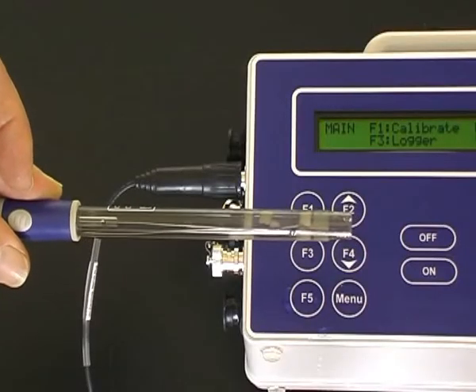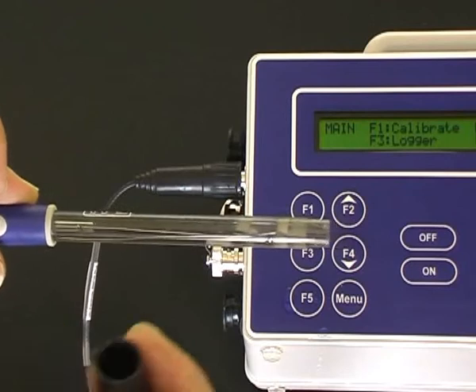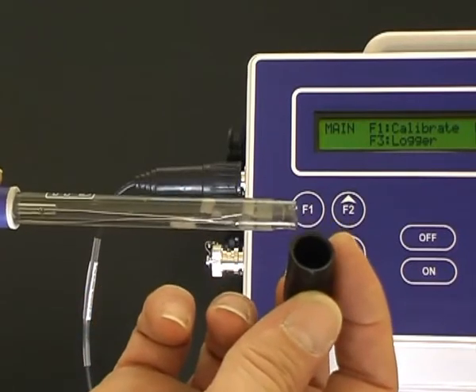To store the pH sensor, just replace the wetting cap back on the end with a bit of tap water in it.